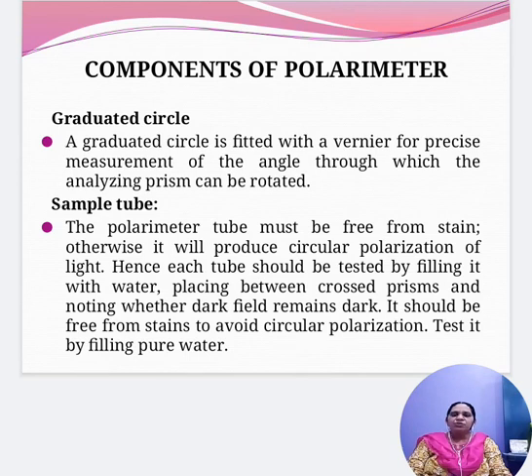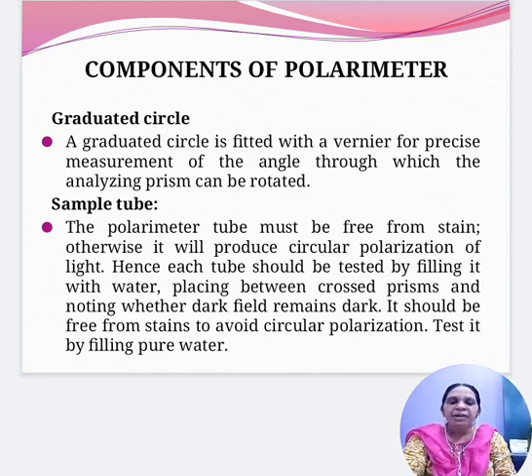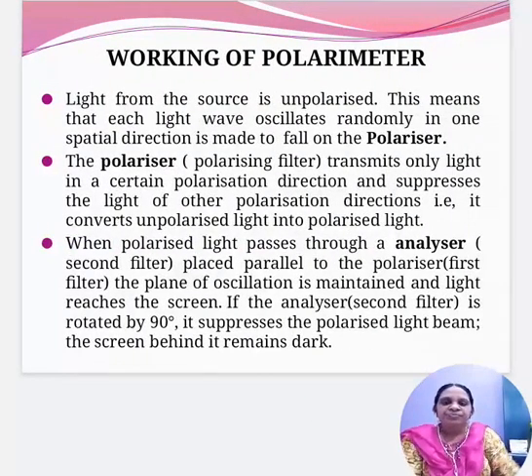Hence, each tube should be tested by filling it with water, placing it between crossed prisms and noting whether dark fields remain dark. It should be free from stains to avoid circular polarization. You can test the sample tube by filling it with pure water.